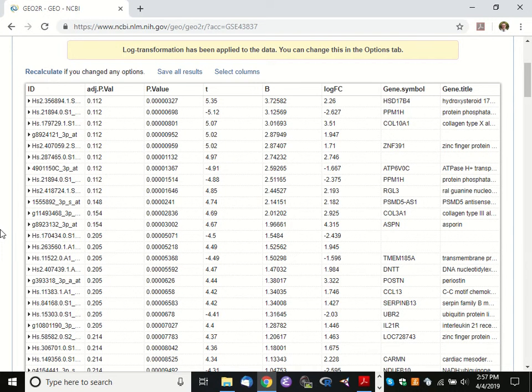We were just looking at a value distribution plot, right? And we said, gosh, I sure hope some sort of normalization takes place that deals with the fact that some of these microarrays were more responsive than others, right? So some sort of normalization has been used, and if you look at the very top line on screen, it says what? Log transformation. There it is, log transformation, brilliant.